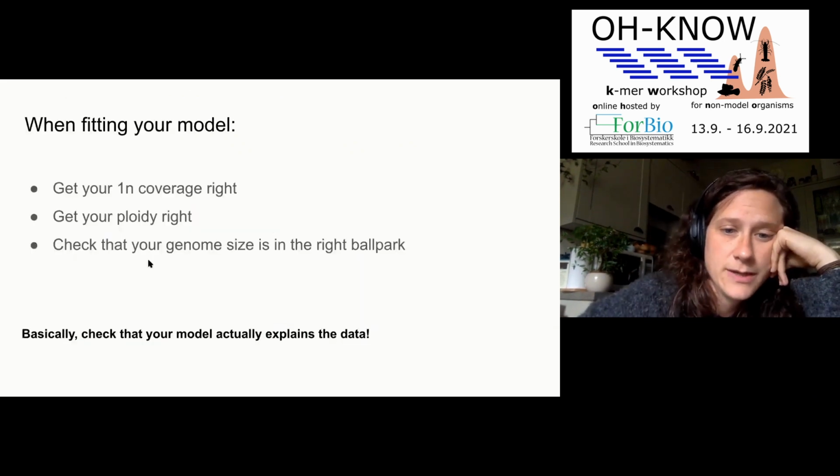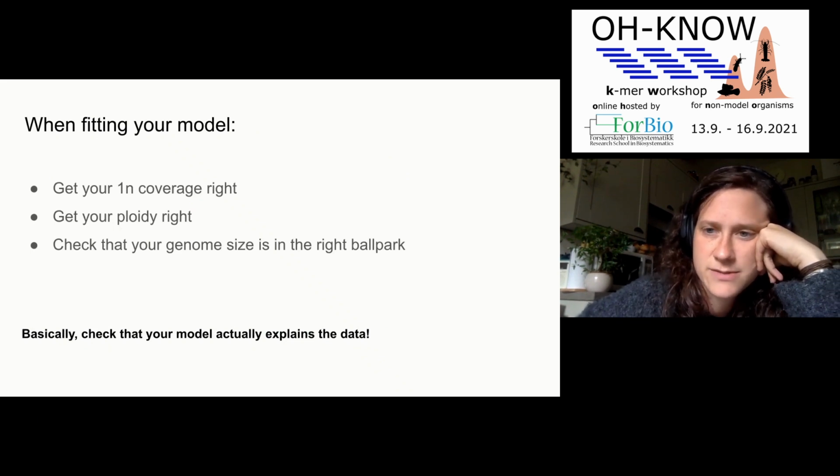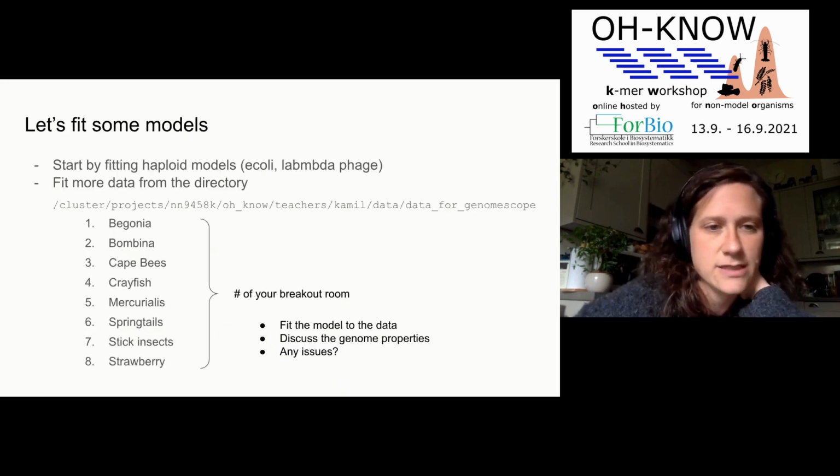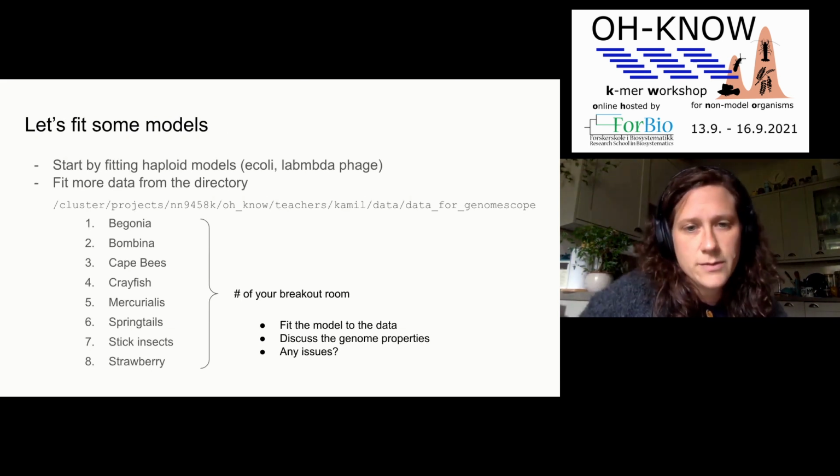Yeah. So basically, main take-home message when using GenomeScope is to properly check that your model actually explains the data, because sometimes you can get weird things. So now we have a little bit of another practical bit.